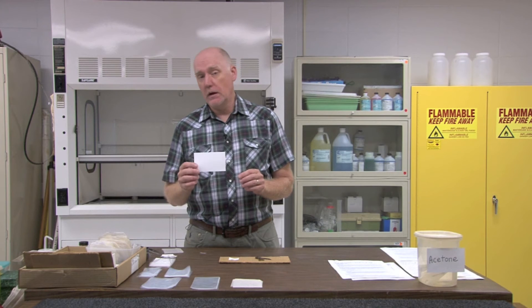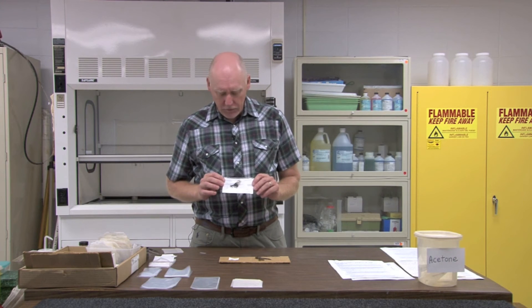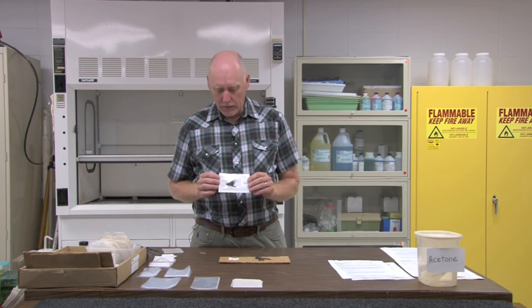At this point, you should transfer your date location information onto a three by five blank index card, and you can do this electronically on your computer and type it, or you can just neatly hand write the information on the card. The information should include the species, the person that determined the species, and the location in as much detail as you can give it. We prefer that you use latitude longitude coordinates. You can also use town range information from a plat book if you don't have a GPS unit, or you can use familiar landmarks such as road crossings, boat landings, and so forth.